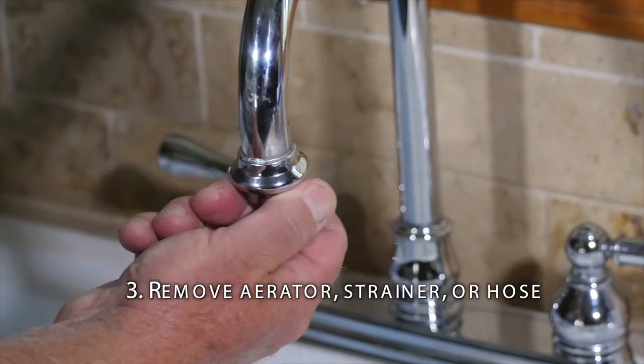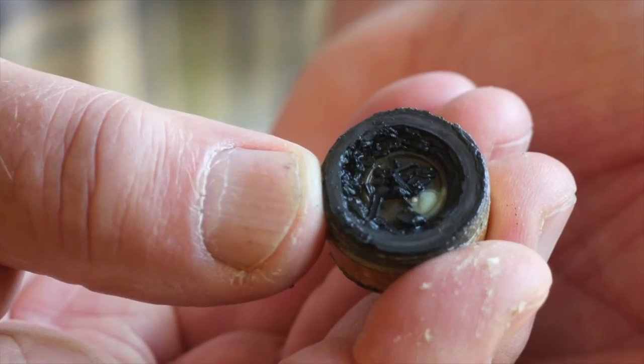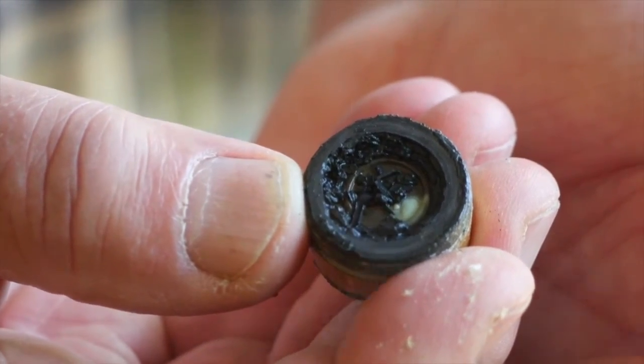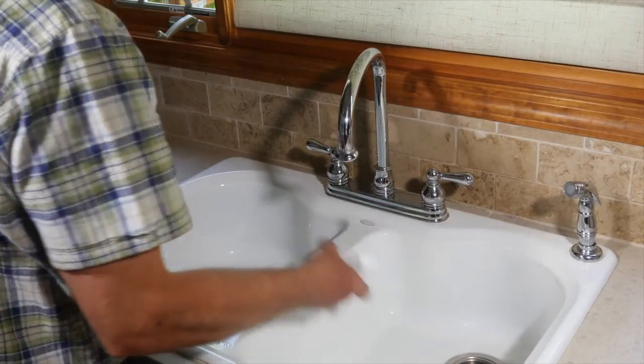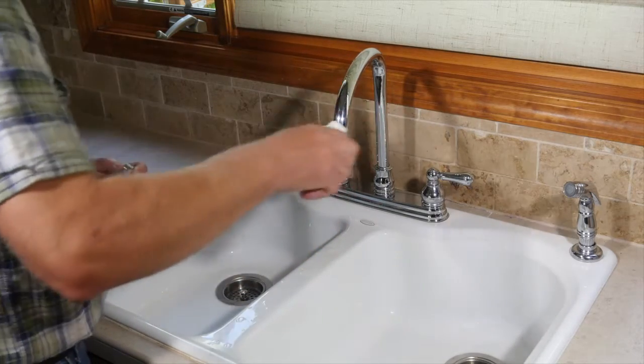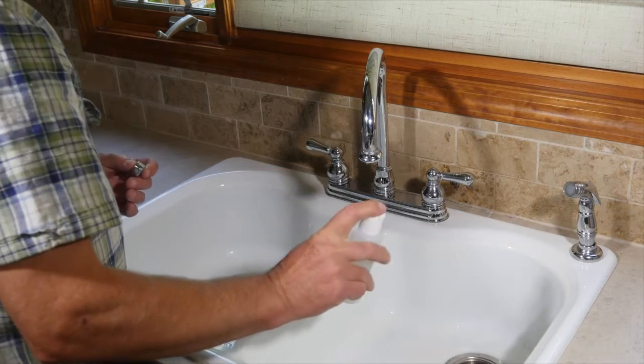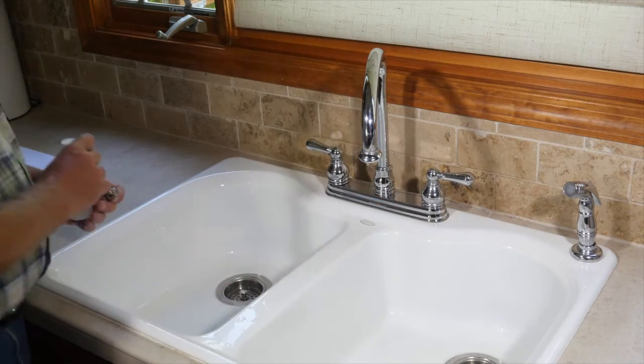Remove the aerator, strainer, or hose. These attachments can trap sediment and biofilms can form on the inside of hoses. Some samplers disinfect the tap with a solution of one part bleach to ten parts of water, or with isopropyl alcohol from a spray bottle. This procedure is not absolutely necessary.